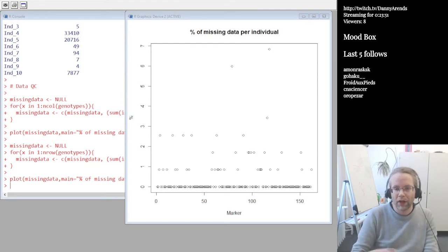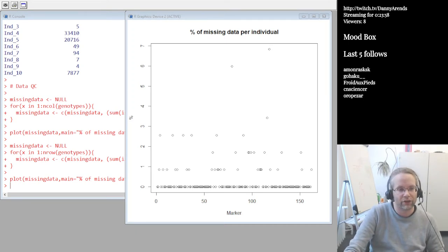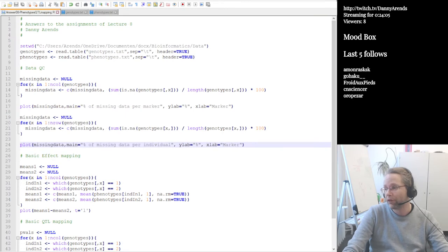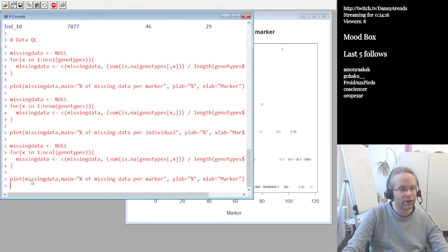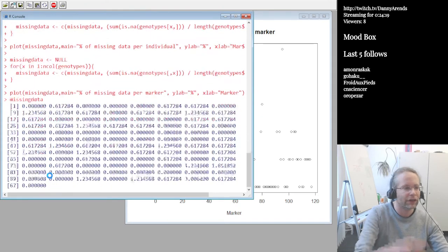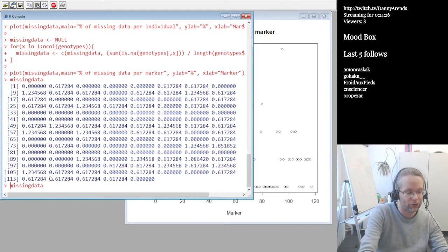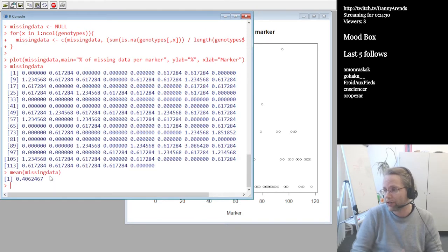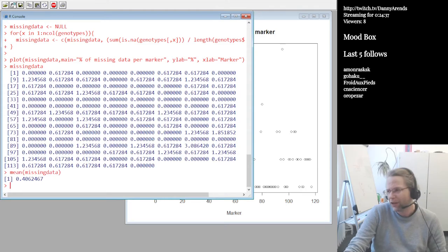The next part asks us to calculate the average percentage of missing data in the genotype matrix. That's straightforward: once we have the missing_data vector from the per-marker loop, we just run mean() on it. The result is about 0.4% missing data on average — really good for genotyping. This is what you'd expect, because nowadays SNP chips are quite accurate at determining genotypes.